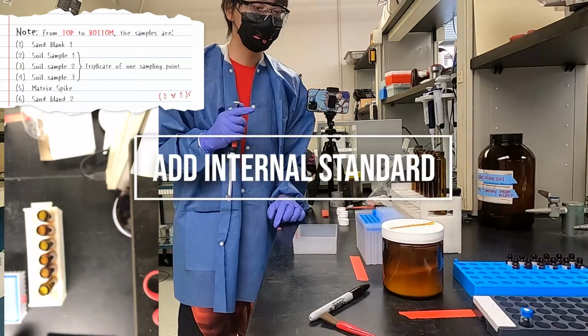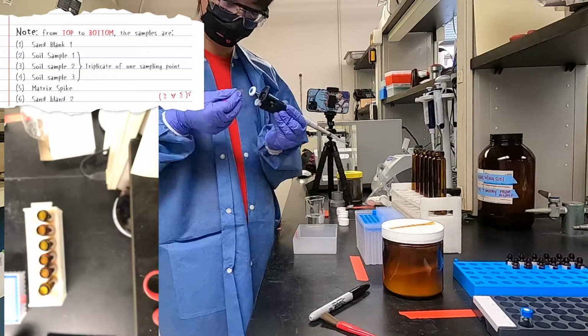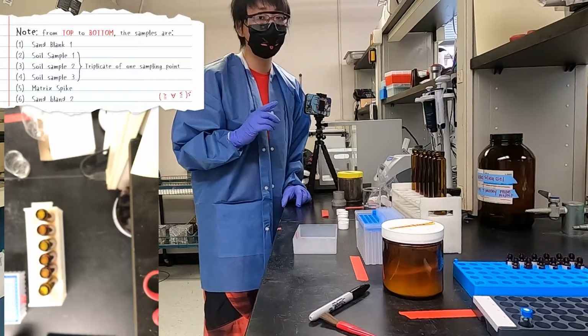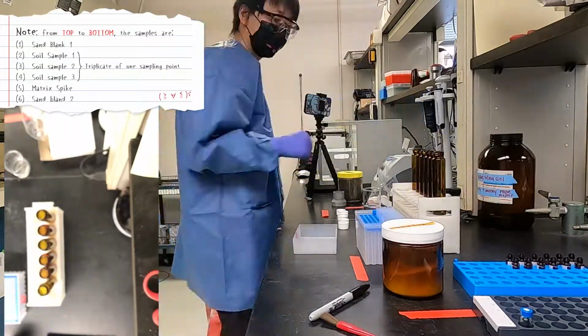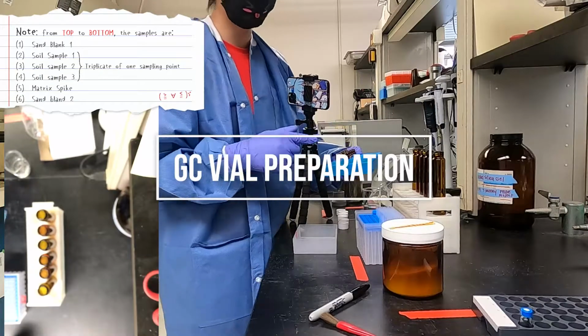And the next step is to add internal standard. After adding the internal standards, we are going to mix the solutions. And then we are going to transfer the samples into the GC vial.